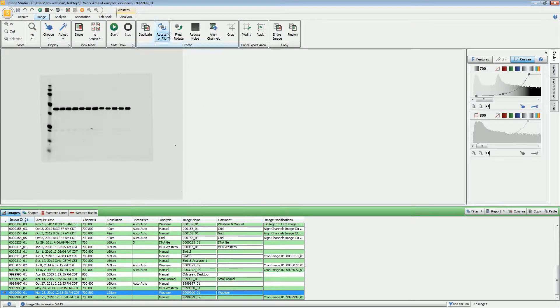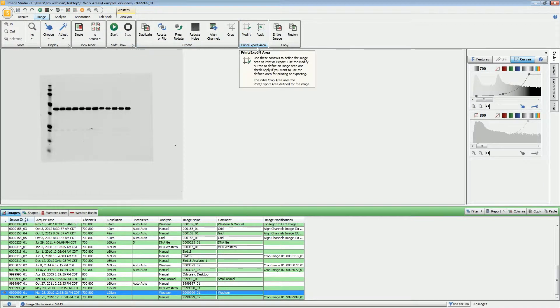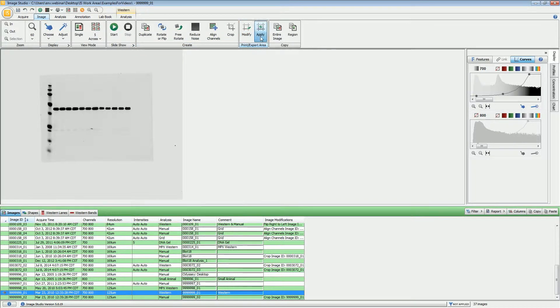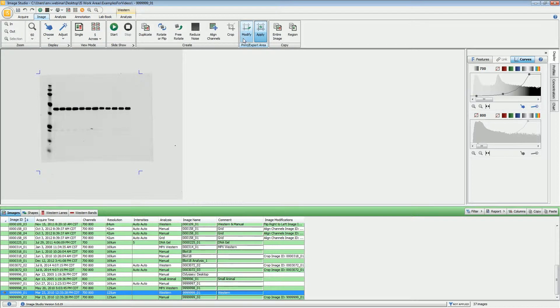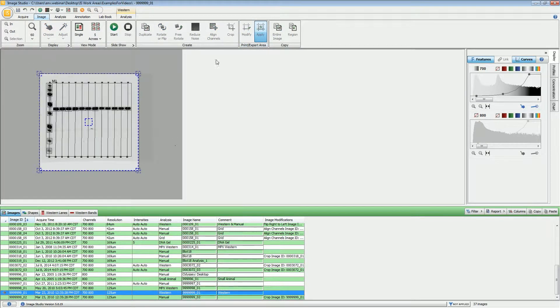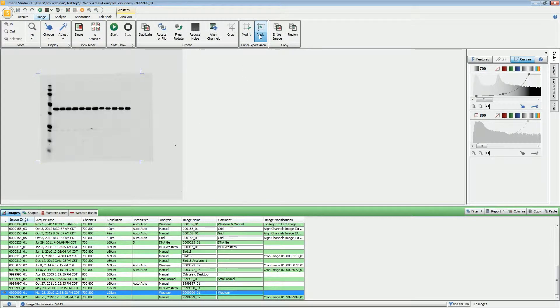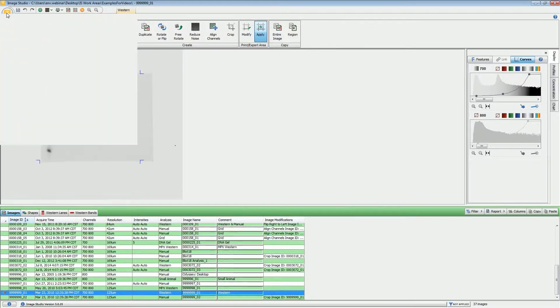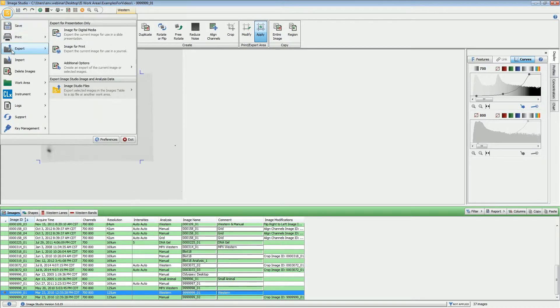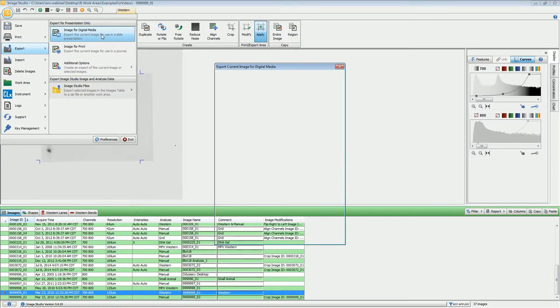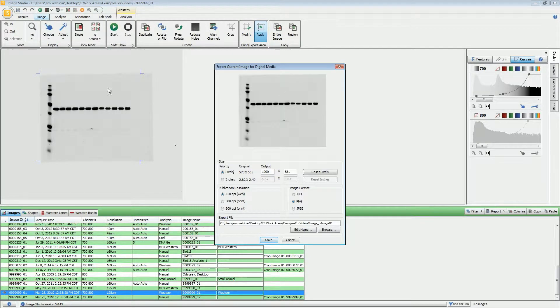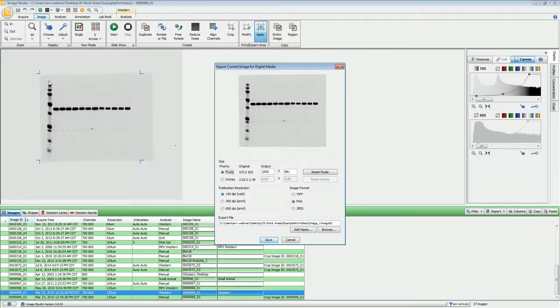If you do not need extra space around here, under the Image ribbon, we have this Print and Export Area. If I apply those, you will see we have these crop marks, and I can modify them to only be the area that I want for the export. So now when I go to the exports, it looks just like what we have here, with none of the lane lines or band markers, and only what is inside of those hash marks.